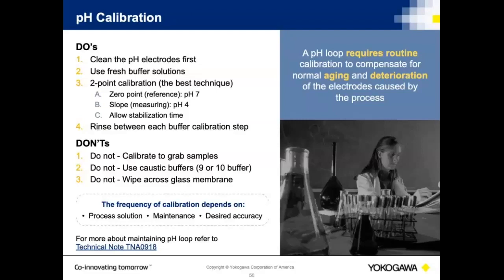Don't do grab samples. It's much better basically to do a 2-point calibration. Make sure your probes are clean. Do not use 9 or 10 buffers, and I'll explain that statement in a minute here.